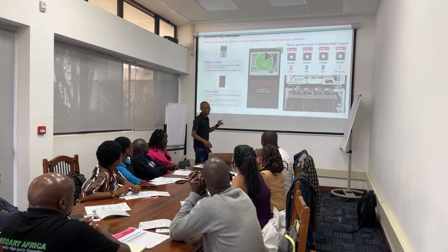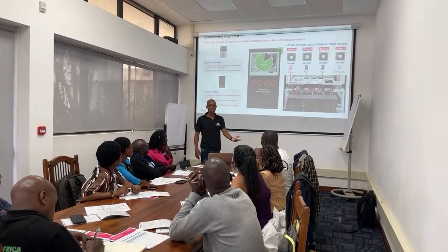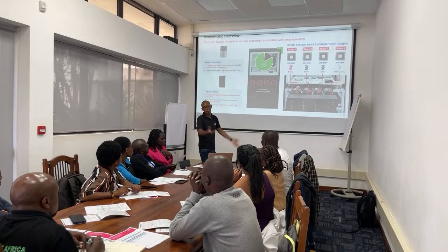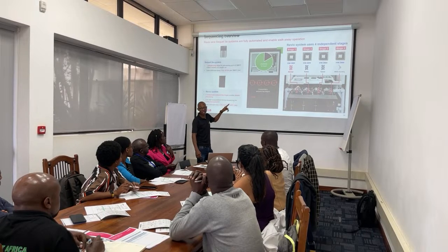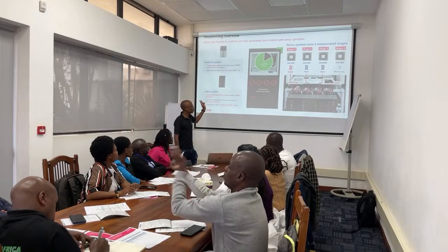And what is nice is you can load one smart cell here, like you can load fish here. Let's say you start running in the morning, and then in the afternoon you receive a human genome. You can start the library. And while this machine is running, you can open it and load the second sample. The other side will just continue.